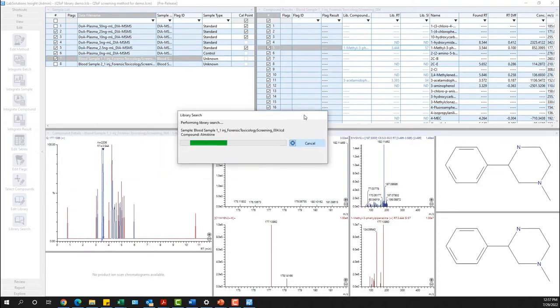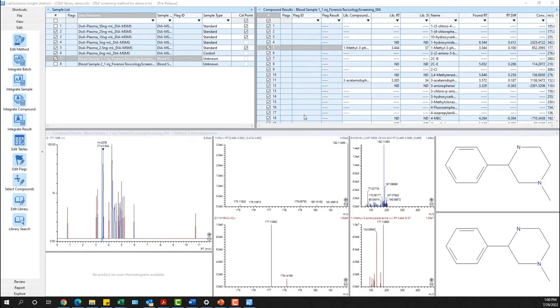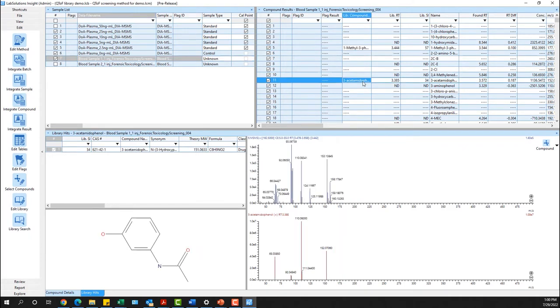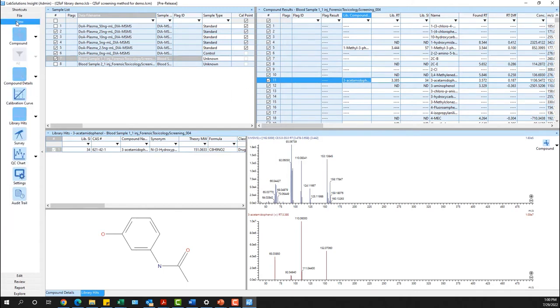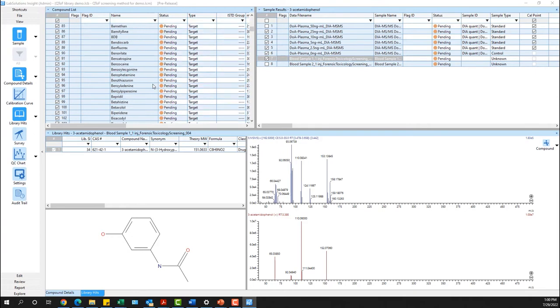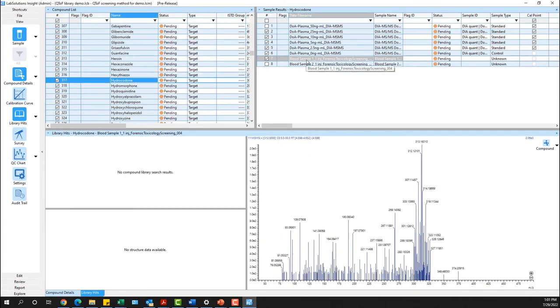A variety of workflows can be completed depending on how you would like to utilize the library search function within your data. The first workflow demonstrates library searching all compounds for one individual sample. Changing to sample view allows me to demonstrate the second workflow: library searching for a single compound in all samples.